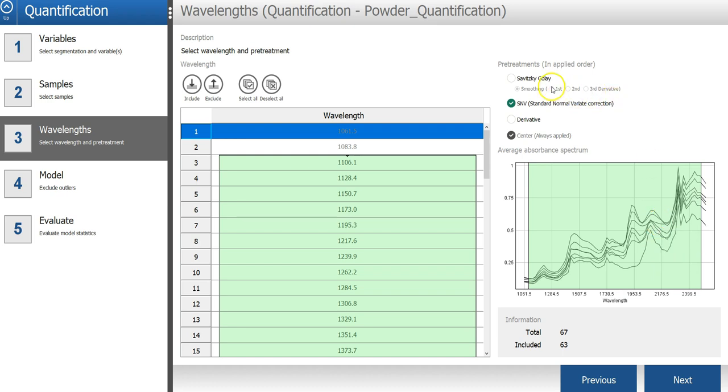Above that, you also have an option where you can select different spectral pretreatments to use. By default, I will use this SNV, which works well in most cases.